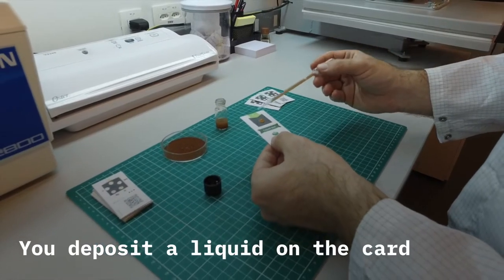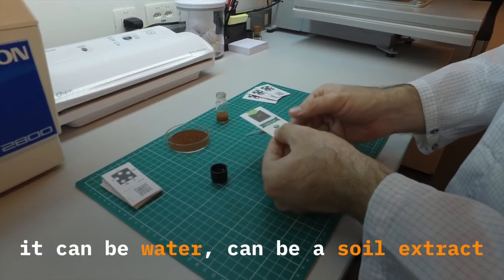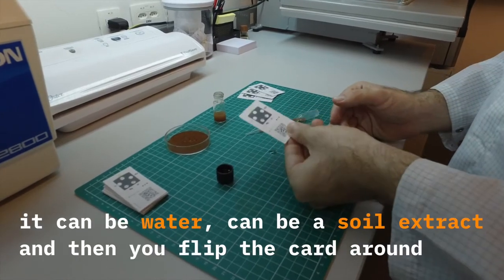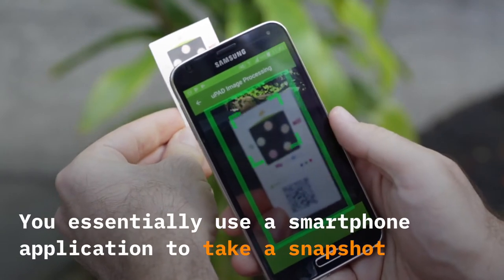You deposit a liquid on the card, just a droplet of the sample. It can be water, it can be a soil extract, and then you flip the card around. You essentially use a smartphone application to take a snapshot.